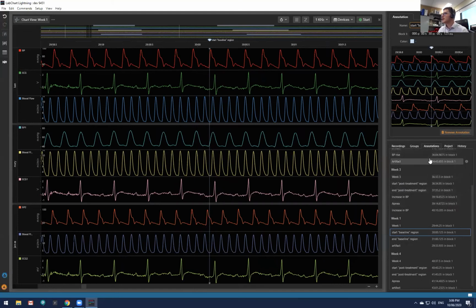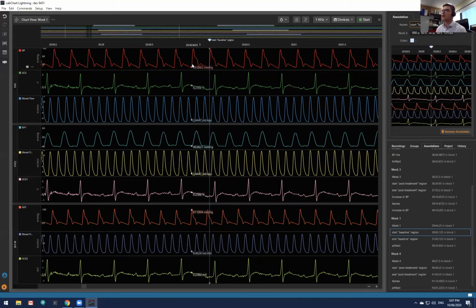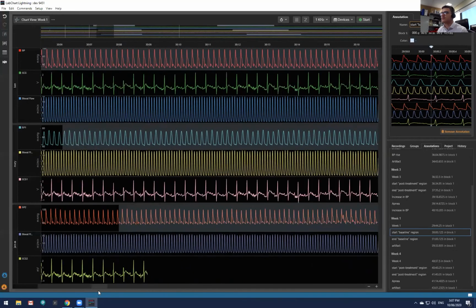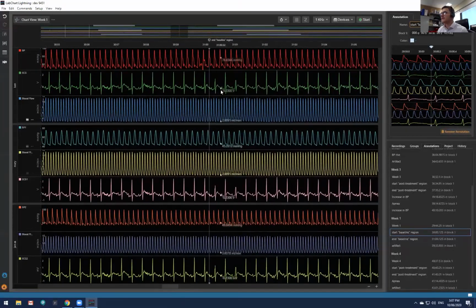The first thing we see in our Lightning view is a little screen showing whereabouts the comment is. You can see that the annotations are now above. If they are full, if they're blue like this, blue is the default color, that's highlighting that particular annotation. If I search for another annotation around here, this annotation here, I haven't selected it, so it's hollow.